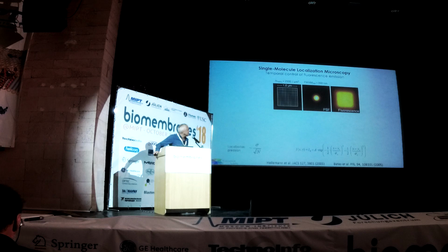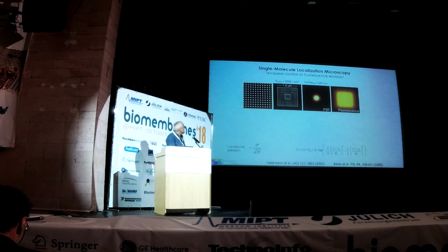So the trick behind all these different techniques which have been introduced is that you either confine the fluorescence emission of fluorophores to a specific area only, or that you temporally, in time, separate the fluorescence emission of single fluorophores stochastically. And this is the trick behind single molecule localization microscopy, so that you temporally control the fluorescence emission of single fluorophores. So just to introduce this technique, because there will be another talk also using single molecule localization microscopy this afternoon given by Mike Heilemann. So to introduce this technique, just a single slide.